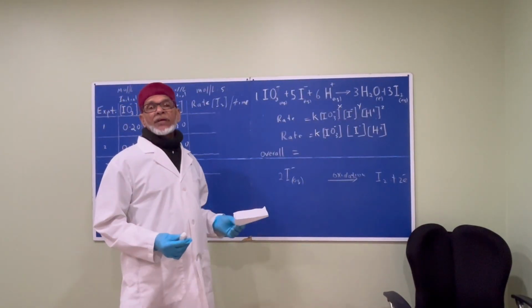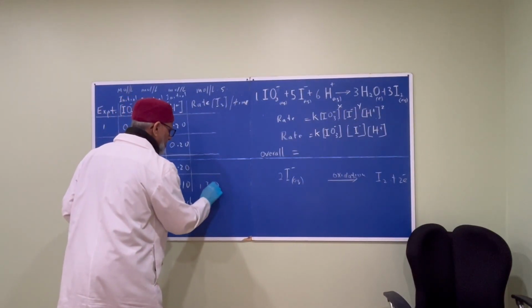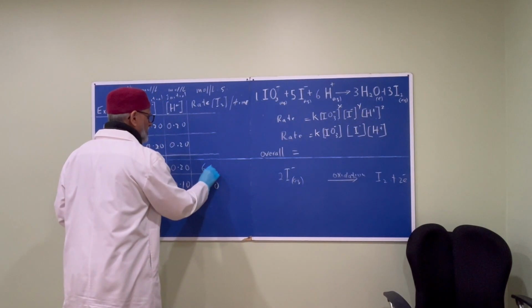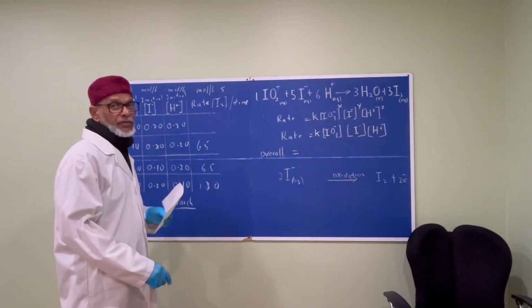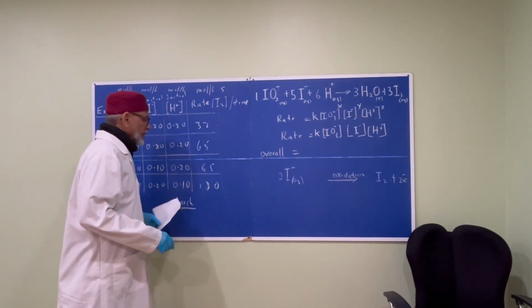We have established some patterns, right? This is about 130 seconds, okay? This one was 65, that one was 65, and this one is about 32. So why don't we make that 32 seconds, okay? All right.